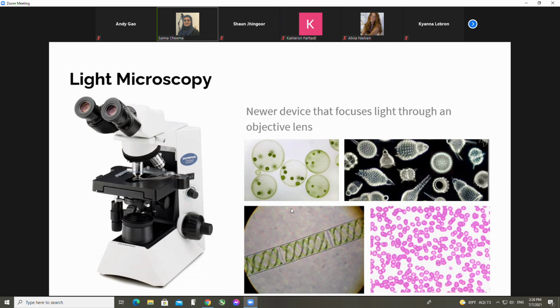Okay, so I'm telling you, let's say we're using one objective that has the numerical aperture of 0.4, okay? And then we're either using red light or blue light to look at the same specimen. Everything else is the same. The difference is the wavelength of light, okay?